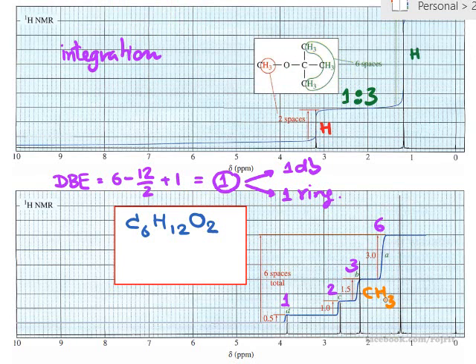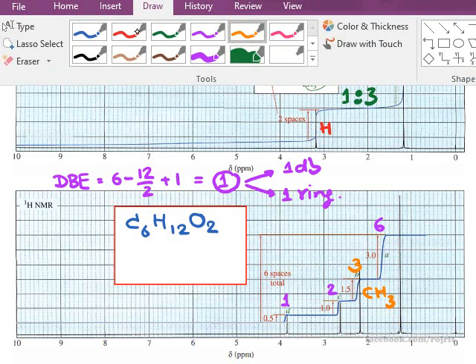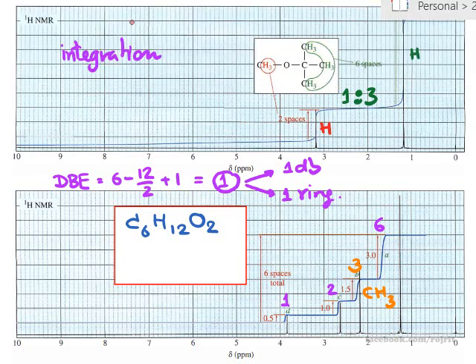I will use yellow color instead. And for 6, right? You don't have CH6. That means for this 6, you should have 2 of the CH3, 2 of the methyl, right? It should be something like this. And then again, you have 2, so it should be CH2 maybe.